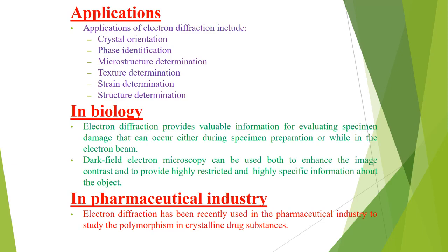And when we discuss its application in the field of biology, electron diffraction provides valuable information for the evaluation of specimen damage that can occur either during the specimen preparation or while in the electron beam.